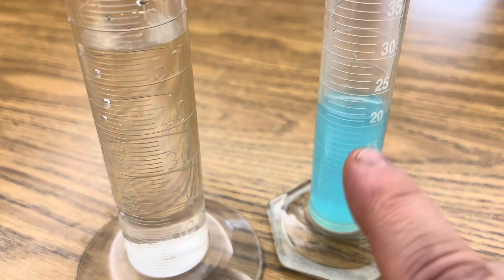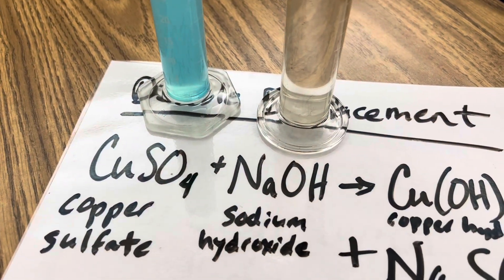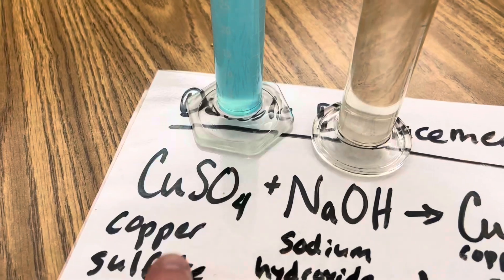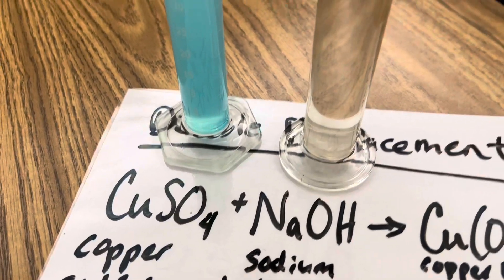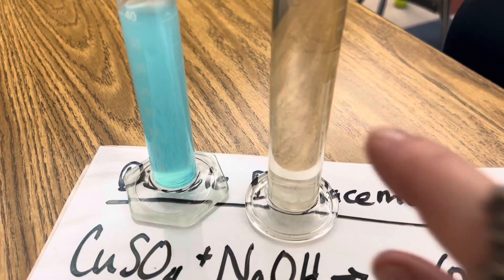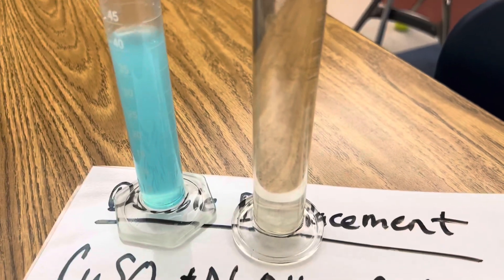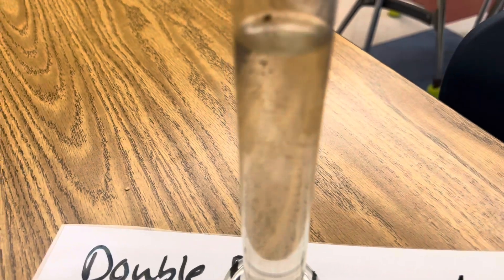And then when they're completely dissolved, you're going to combine the two. Now, once both are completely dissolved, you're ready for the moment of truth. Here's your solution of copper sulfate. Here's your solution of sodium hydroxide. These metals are going to trade places and you're going to immediately see a precipitate. This copper hydroxide is going to form over here. It'll look like kind of a blue gelatin mass, and also sodium sulfate. Check out what happens the minute I start adding the solutions together.